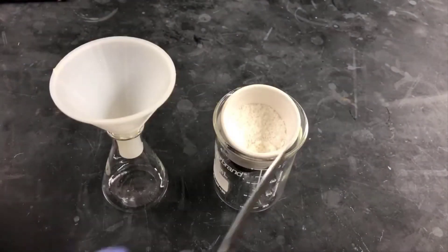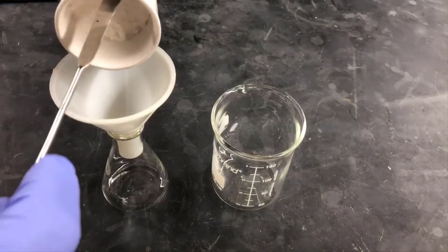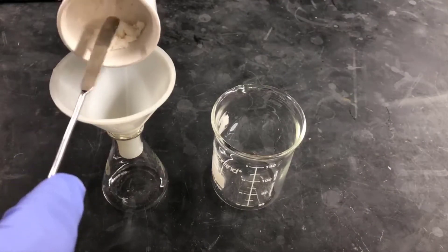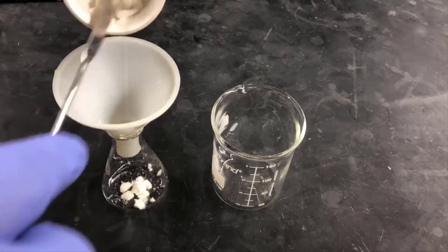I'll be doing the recrystallization in a small Erlenmeyer flask. The next step is to transfer the crystals into the Erlenmeyer flask. Here I'm using a powder funnel to make it a little easier to get them in.